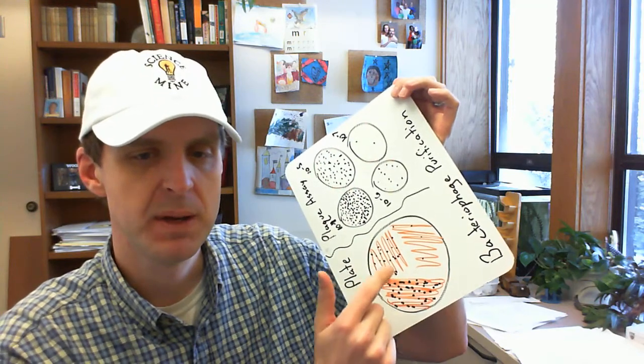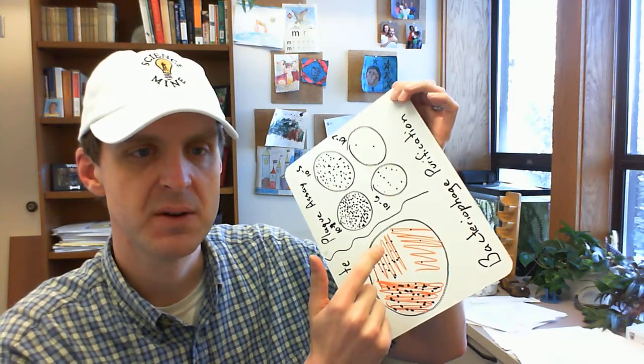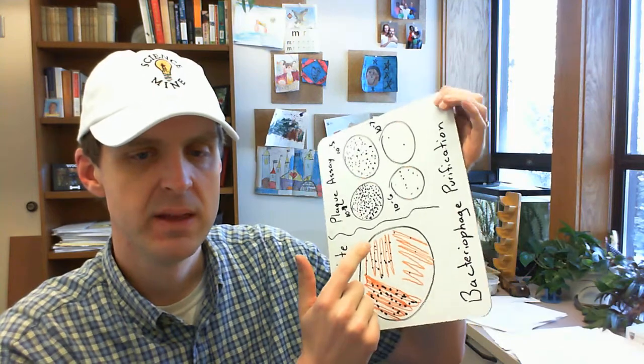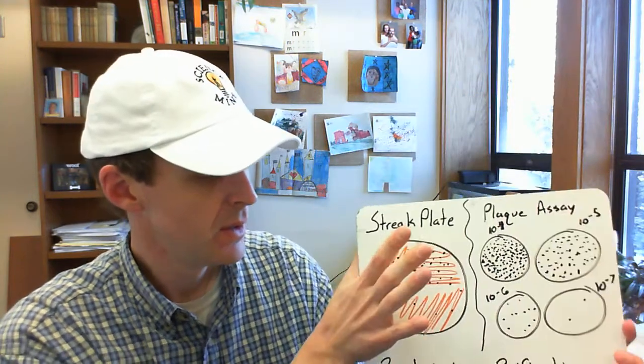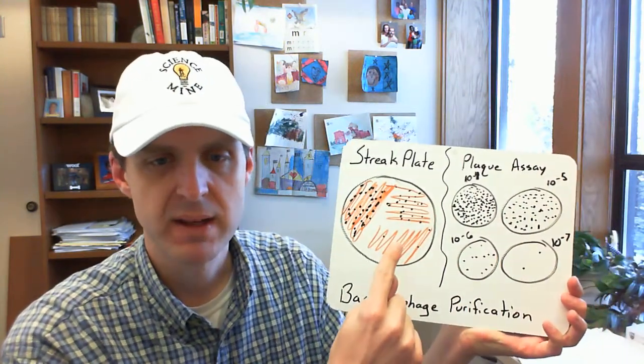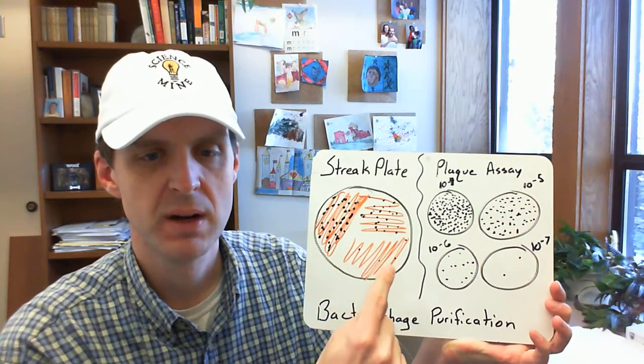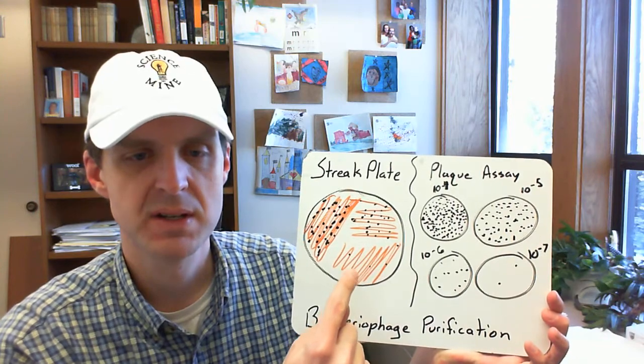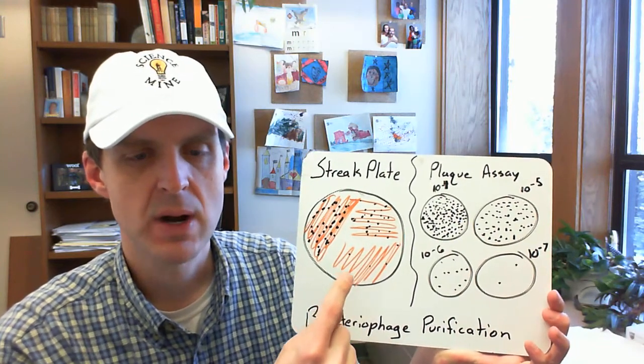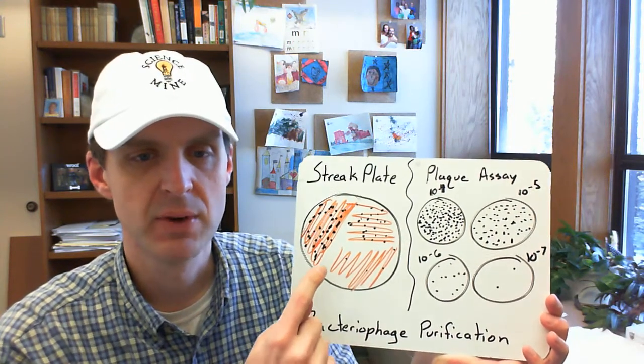The idea is that the bacteriophage plaques are going to be too close together down in this area to pick a well isolated plaque. It's a little bit better in this area and depending on how many you pick up here maybe it's this area that you're gonna find your plaque that you're gonna pick.